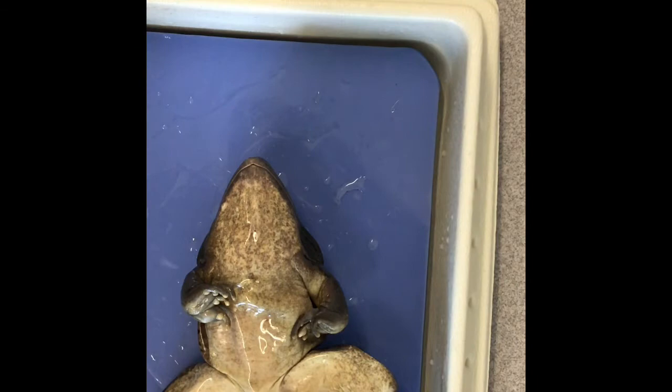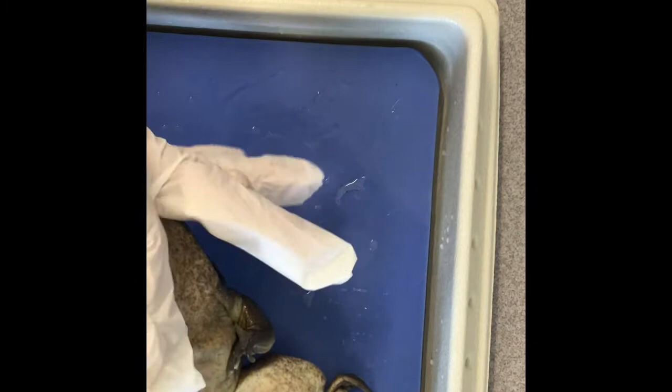There are forelegs and hind legs. Forelegs are up front and hind legs are in the back. You can see for the foreleg there are one, two, three, four fingers.